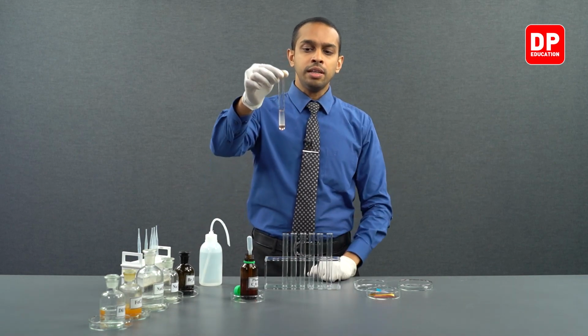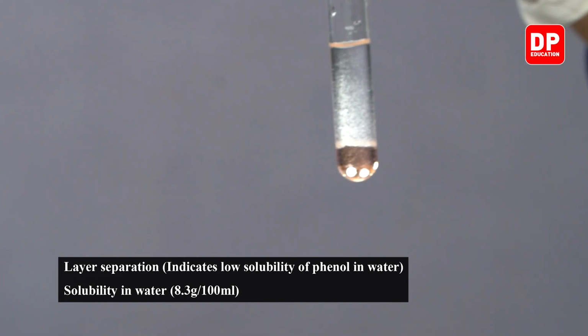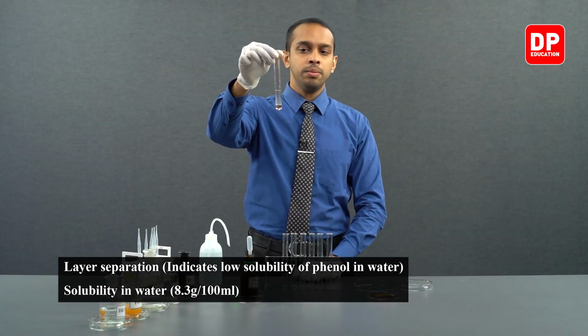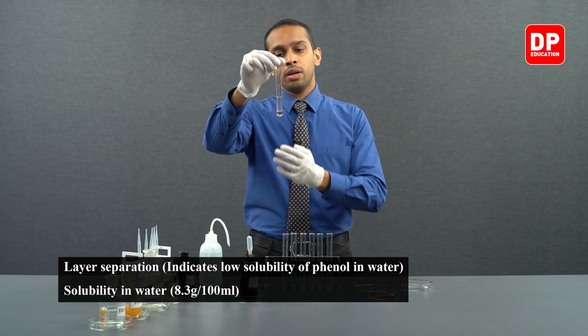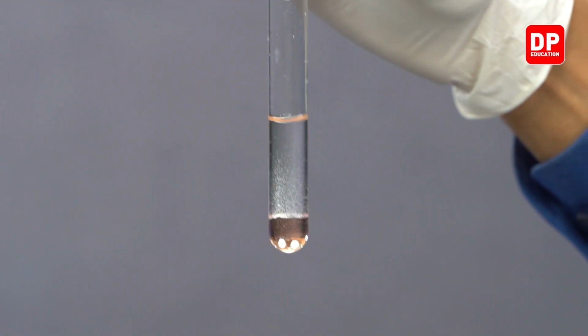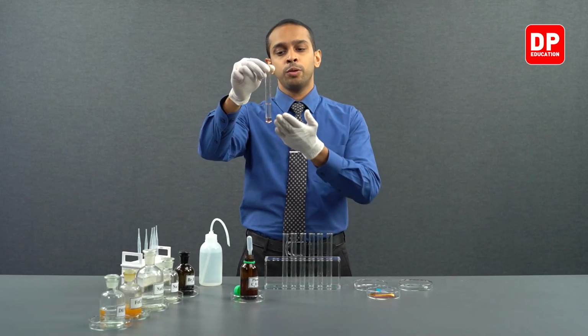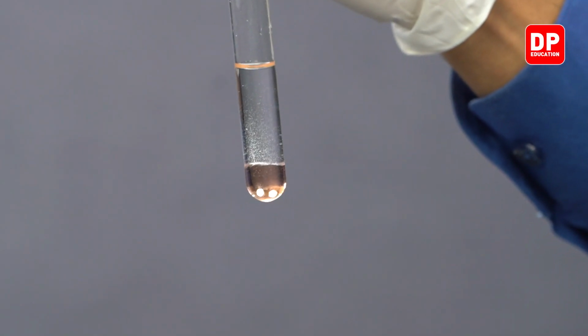At first glance, you would see a layer separation. You can see the phenol layer at the bottom and the water layer at the top. The phenol layer will sink to the bottom as phenol has a higher density than water. So therefore, you will observe the phenol layer at the bottom and the water layer at the top.